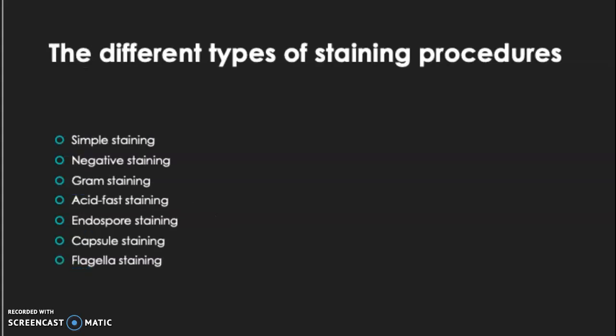The different types of staining procedures we will be talking about today are simple staining, negative staining, gram staining, acid-fast staining, endospore staining, capsule staining, and flagella staining.